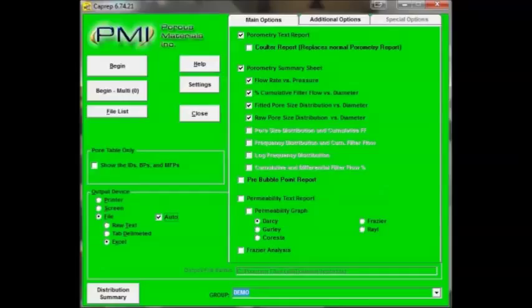Back on the report program main screen, you can select the output device in the bottom left. This allows you to choose the type of file output. Before we were looking at screen outputs. You can also select tab delimited text, text documents, or Excels.